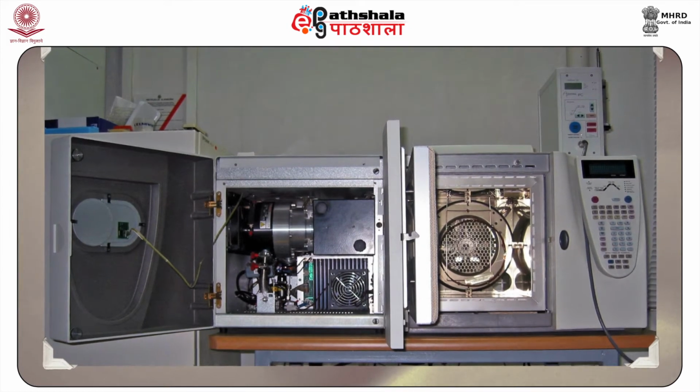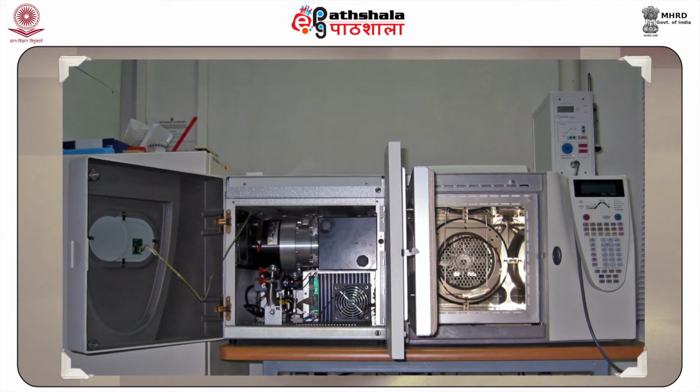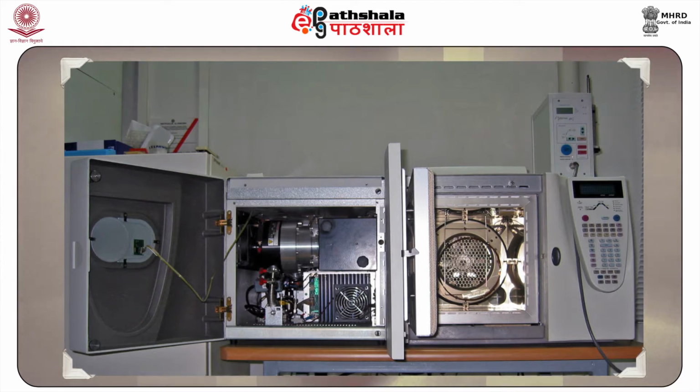Now, the basic principle of GC is similar to other previously mentioned chromatographic techniques. It has various marked differences too. Firstly, in GC, the mobile phase is a gas and the stationary phase is liquid, whereas in column chromatography, liquid acts as the mobile phase and a solid as the stationary phase. Hence, gas liquid chromatography is the full name of this technique. Secondly, there is an oven which contains the column through which the mobile phase passes to control the temperature of the gas, whereas there is no such temperature control in column chromatography.